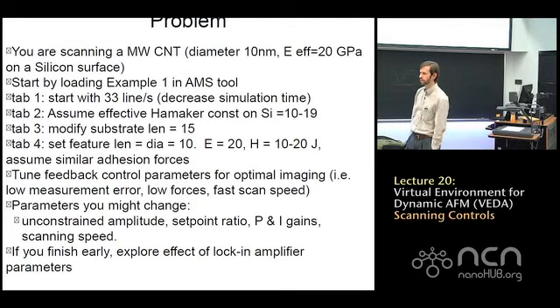So that's one thing that I would hope people get out of this tool is just what are the trends in the various parameters, because you're not going to do this before every experiment because you don't know what your sample parameters are. That's why you're doing the experiment, to figure out what the sample parameters are.